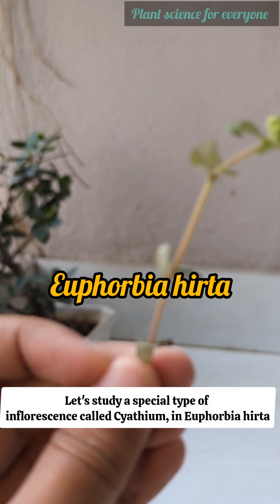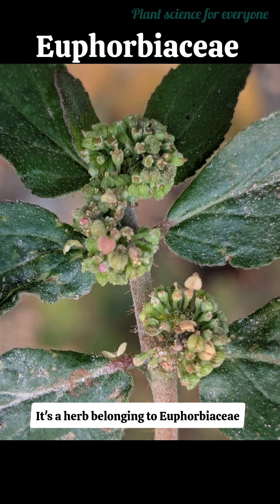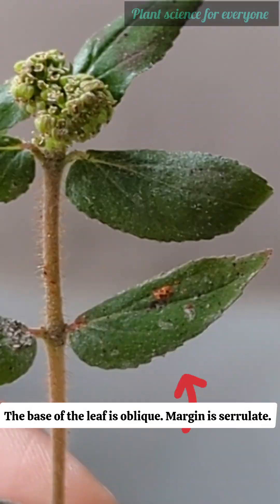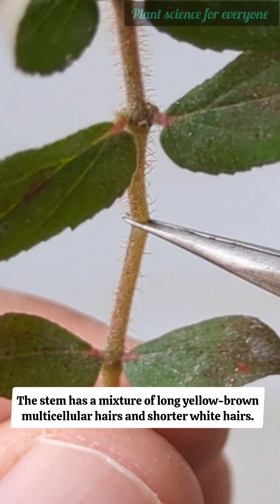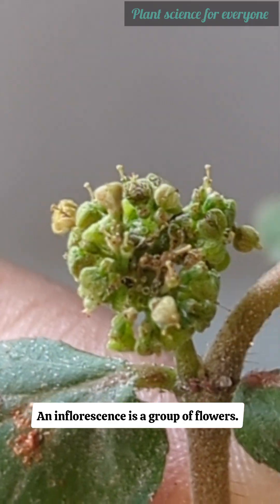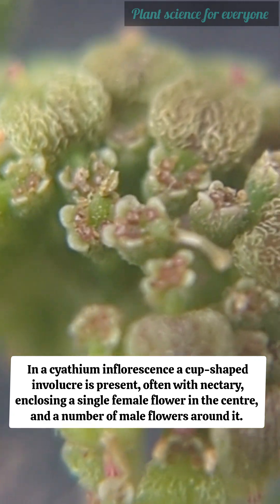Let's study a special type of inflorescence called cyathium in Euphorbia hirta, a herb belonging to Euphorbiaceae. The base of the leaf is oblique, the margin is serrulate, and the stem has a mixture of long yellow-brown multicellular hairs and shorter white hairs. The plant produces white latex.